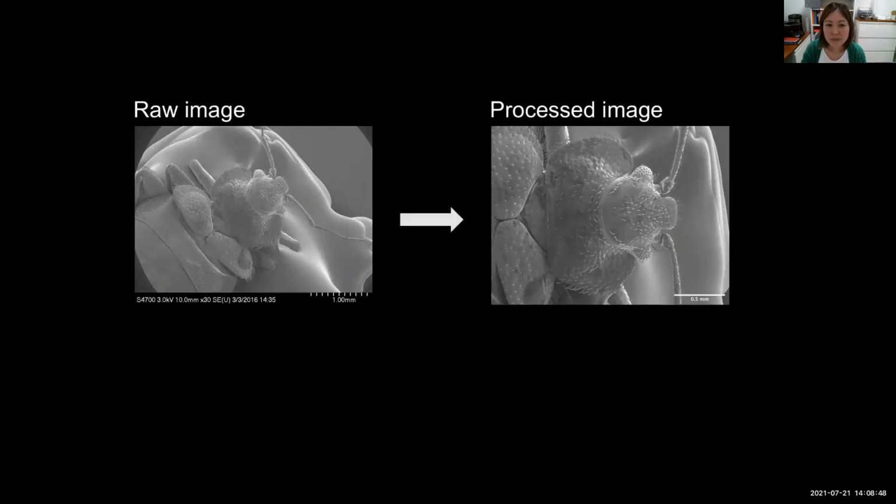So first of all, we're going to use an SEM sample image. I'm just showing you the raw image, and we're going to get to this processed image on the right. So I'm just going to stop sharing the PowerPoint file.